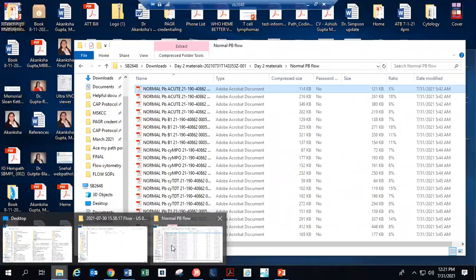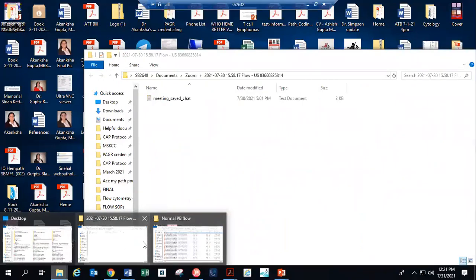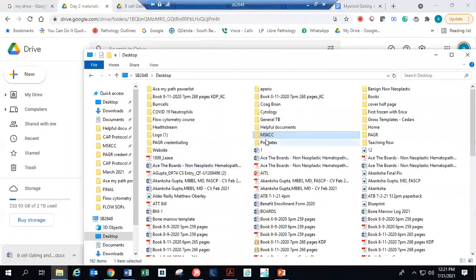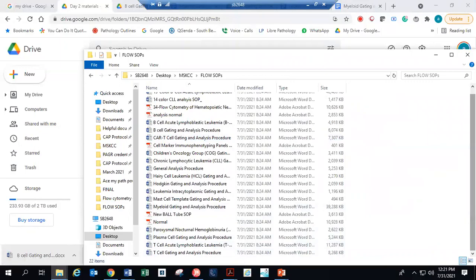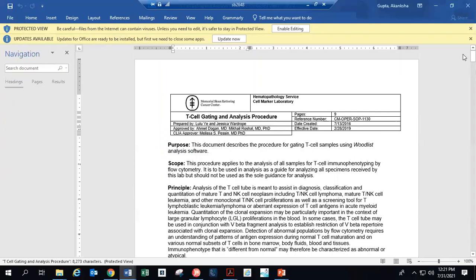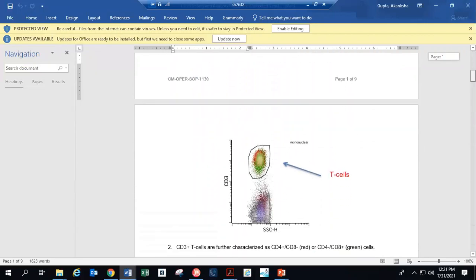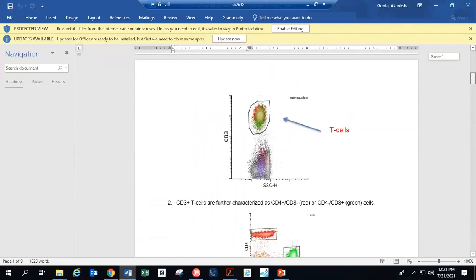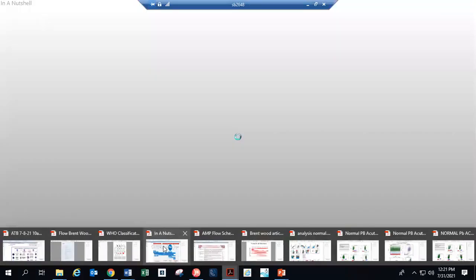So about the T cell subsets showing CD10 expression, those are the follicular helper T cells which are there inside the germinal centers. If there is reactive germinal center hyperplasia, sometimes you can see that, but they should not be monoclonal. You will see a distinct subset of aberrant T cells expressing CD10 in angioimmunoblastic T cell lymphoma in flow. If you see T cells having CD10, always see if they are losing any regular T cell markers. Make sure they are not aberrant. Very good point.